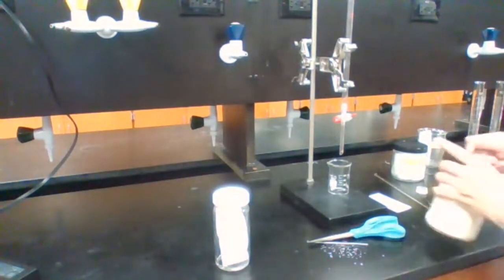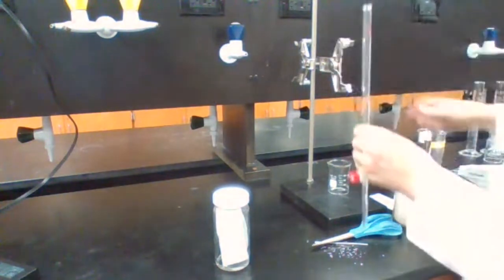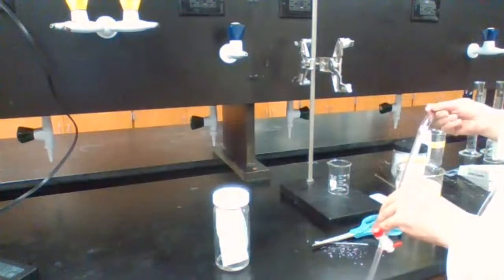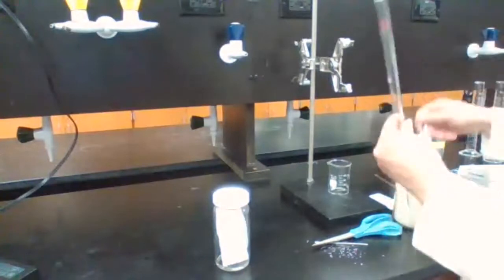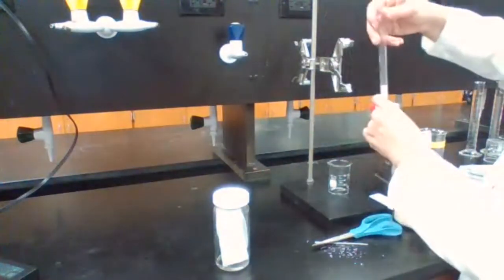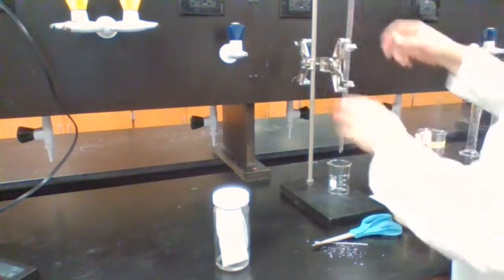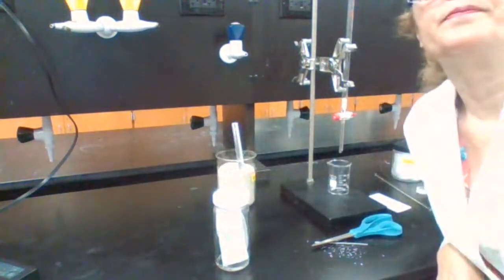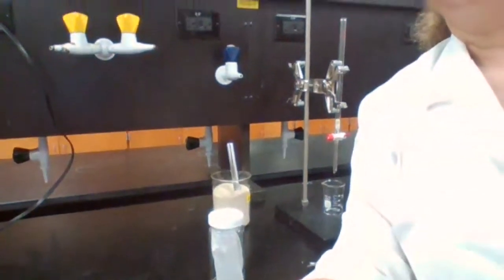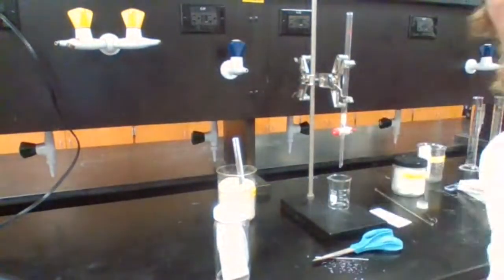And our next item after the glass wool is to add sand. Do you know what's the purpose of using sand? What's the purpose of using sand here? It is to level off the glass wool, because you want to make sure of an even distribution. Yes, to level off the glass wool.